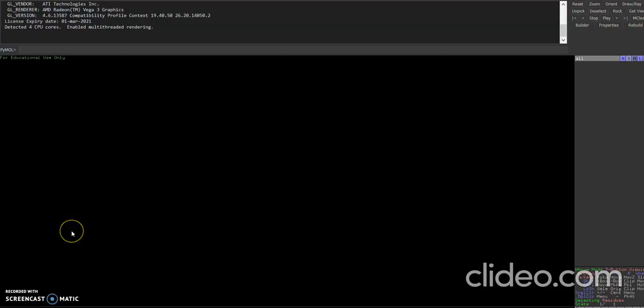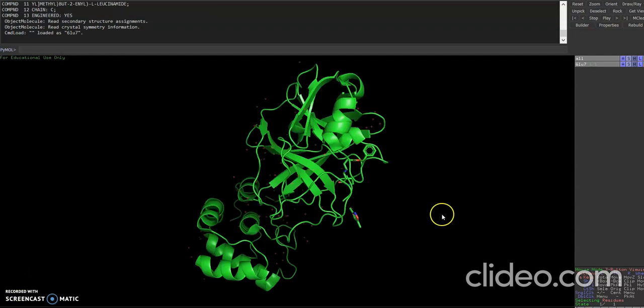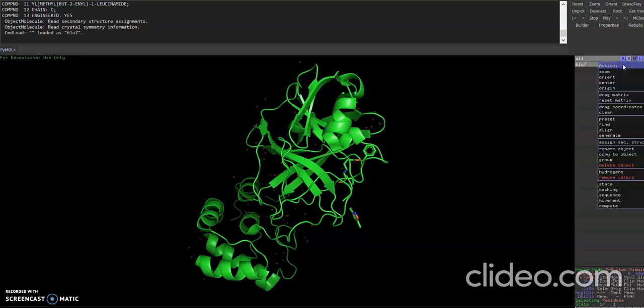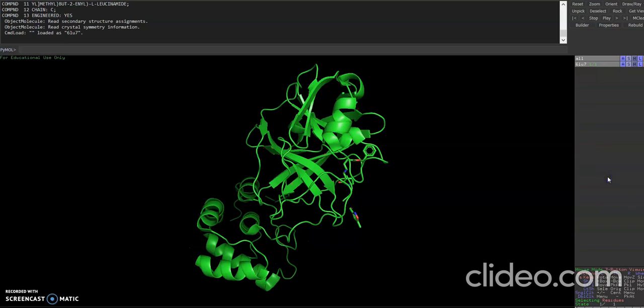The second strategy involves using PyMOL. So we need to upload a structure here rather open it. You can open it by going to file. Now you can see the structure has opened. So the first thing we need to do is remove water. We go here to A that stands for action and click on remove water. After removing water, then as you can see the inhibitor is here.